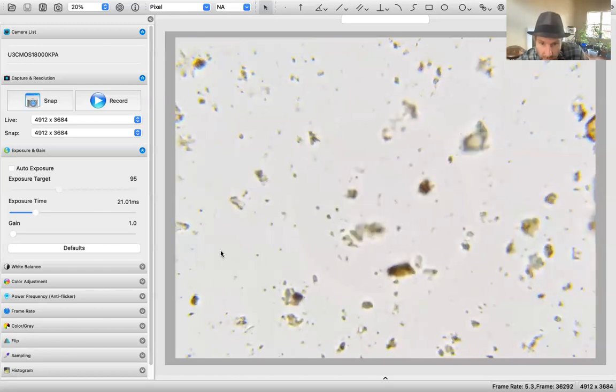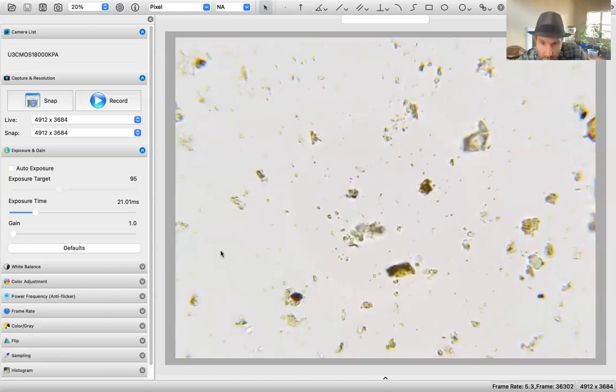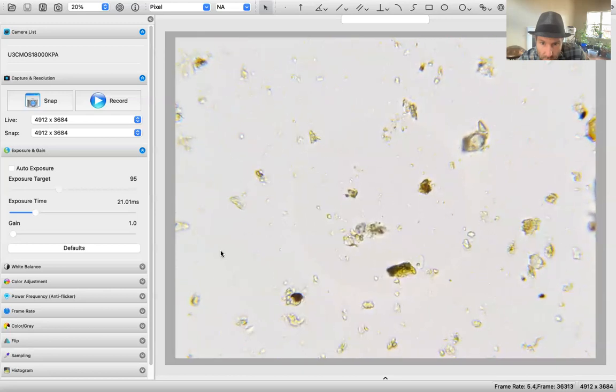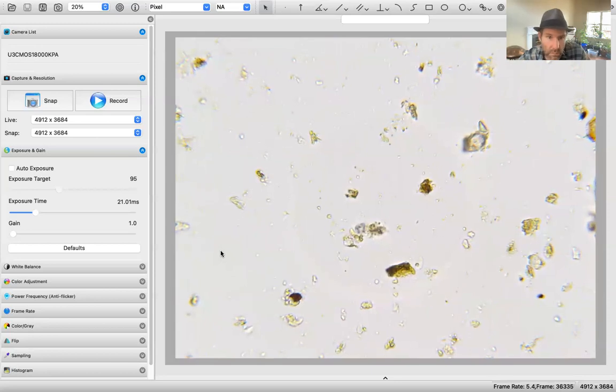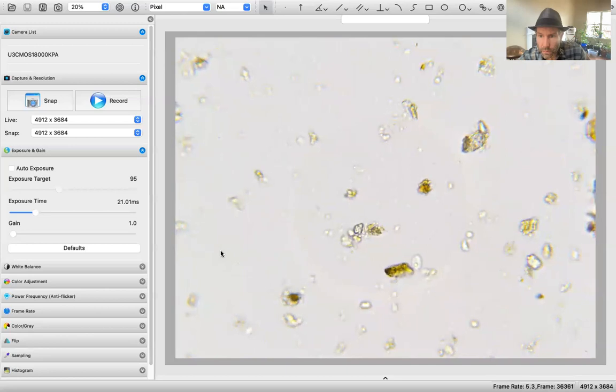Be an amoeba, be an amoeba. Not an amoeba. Ooh, ooh, actino.